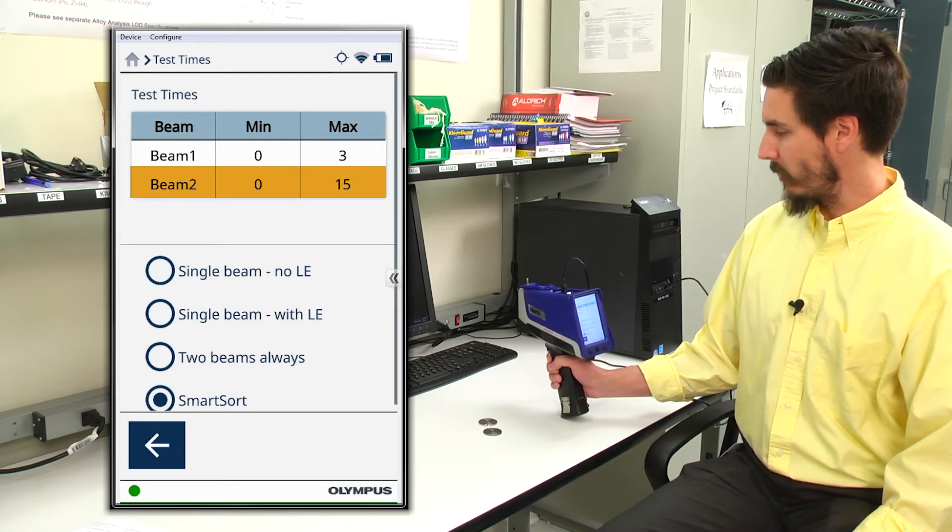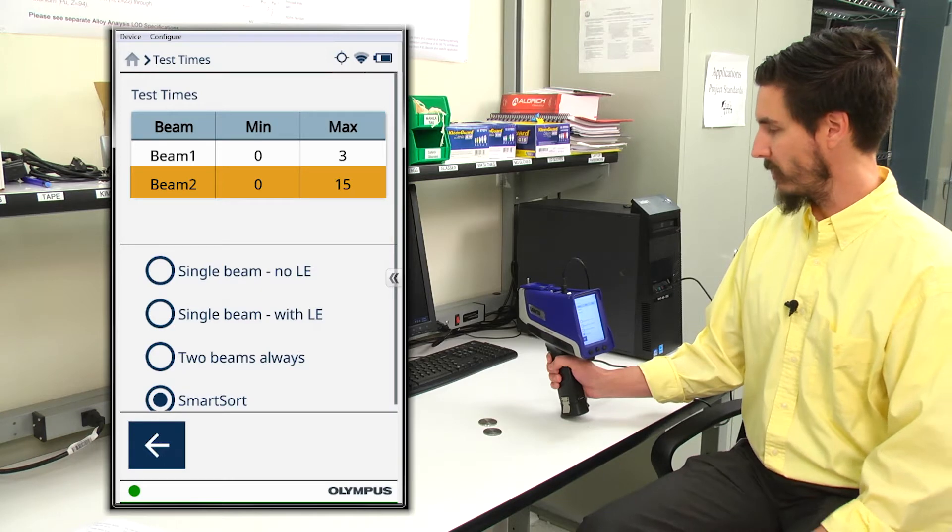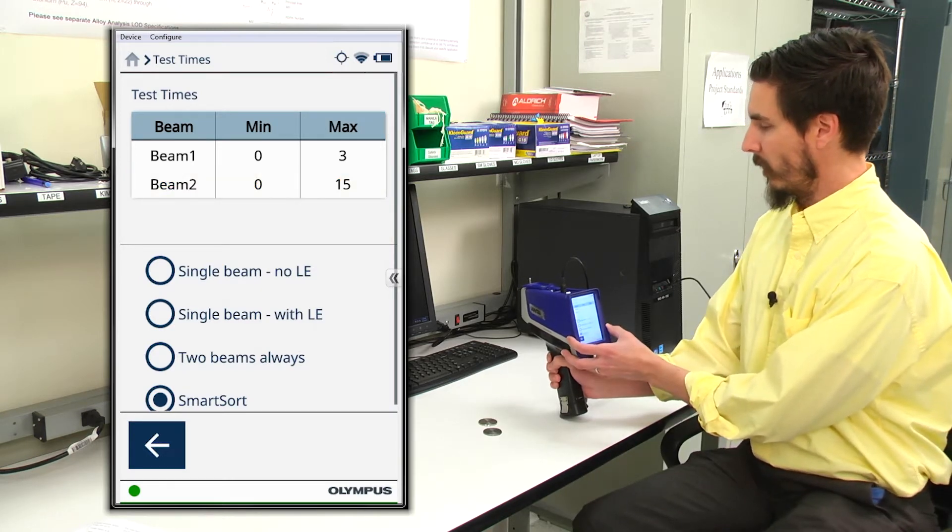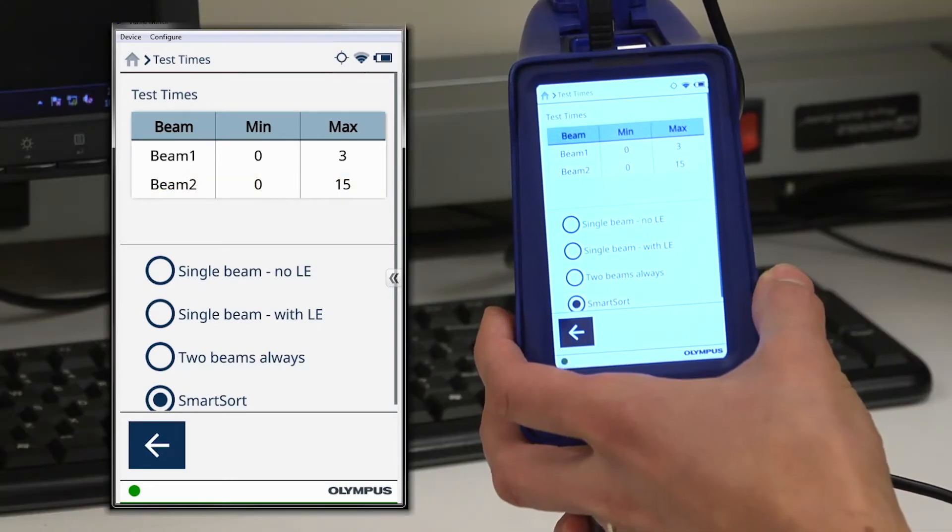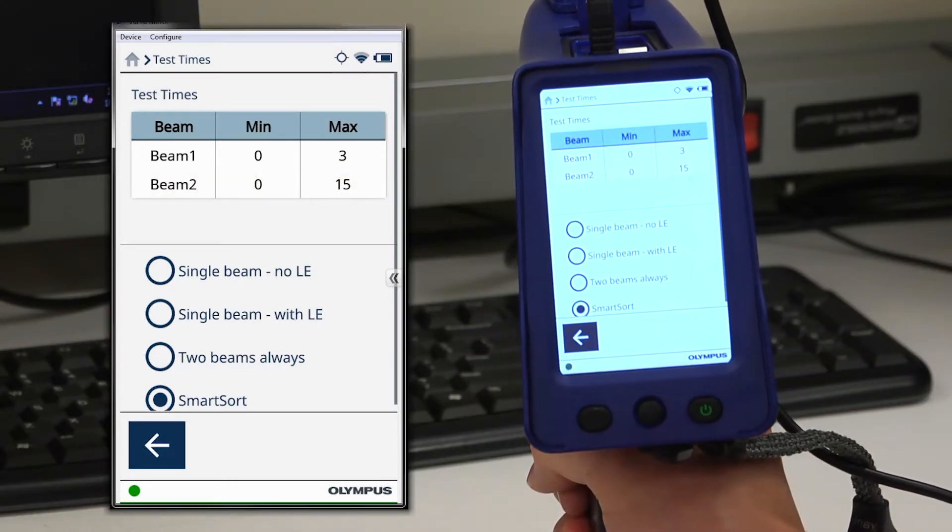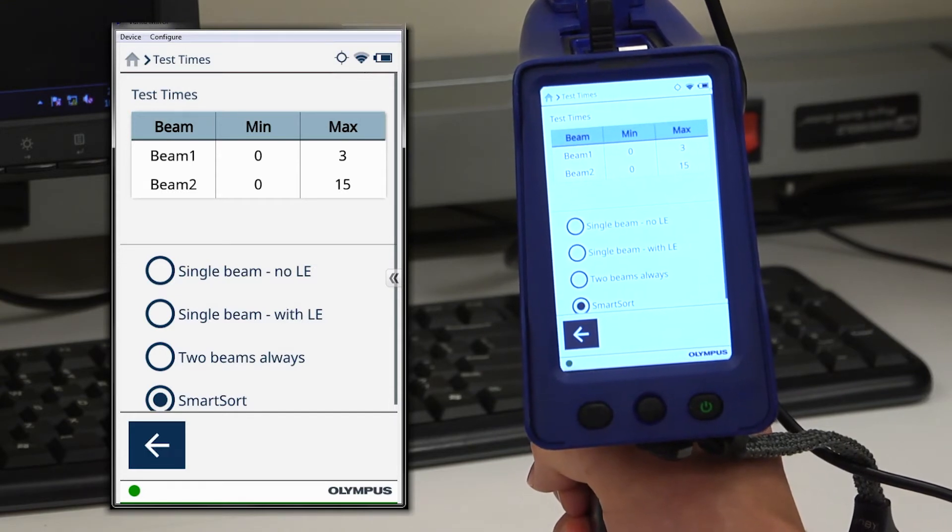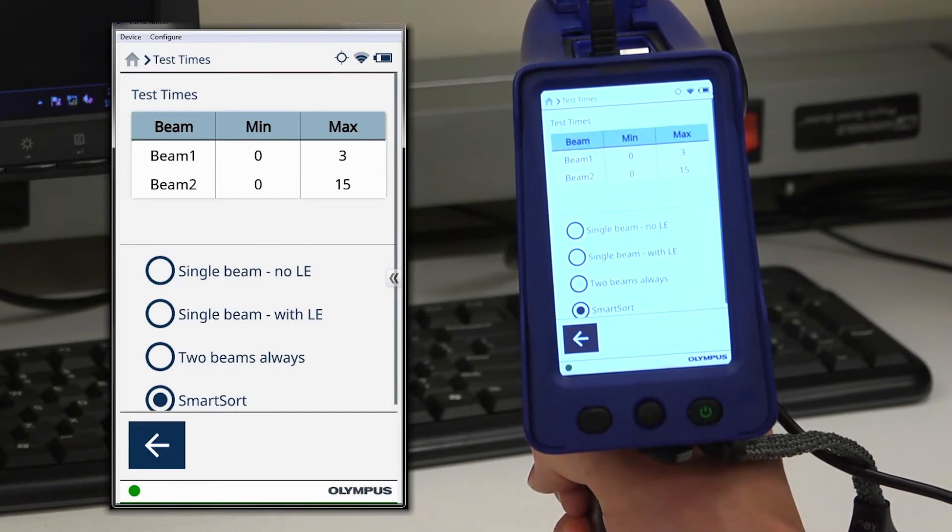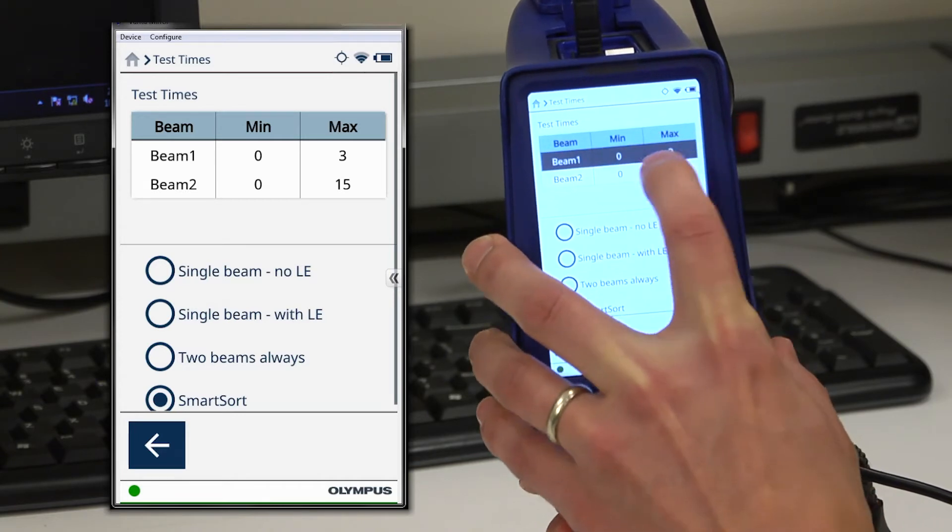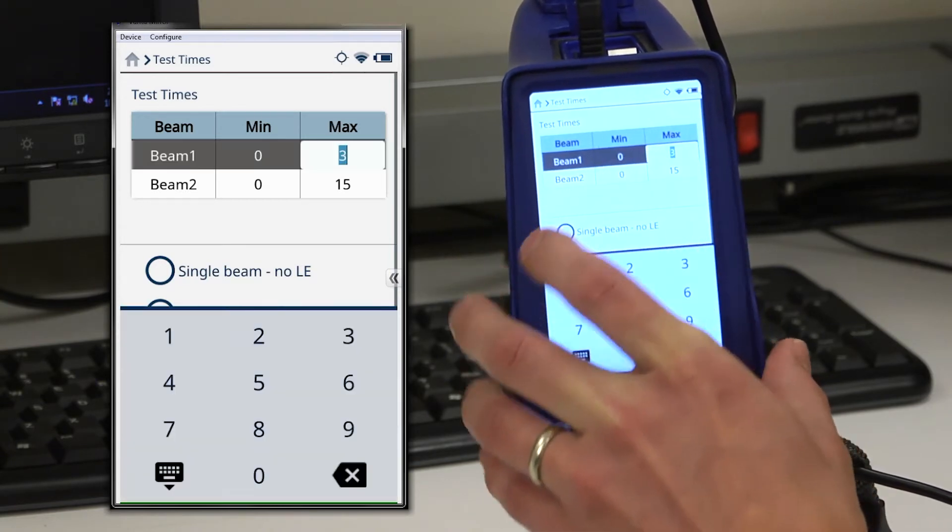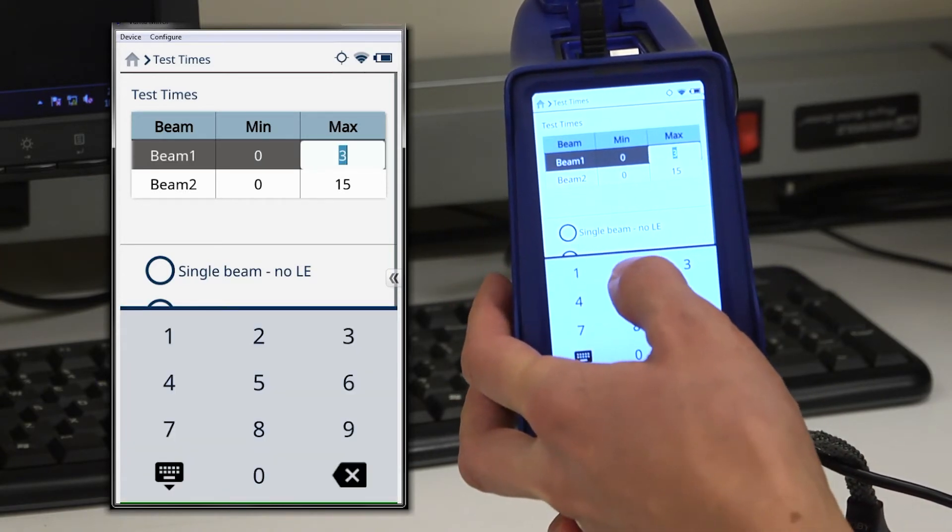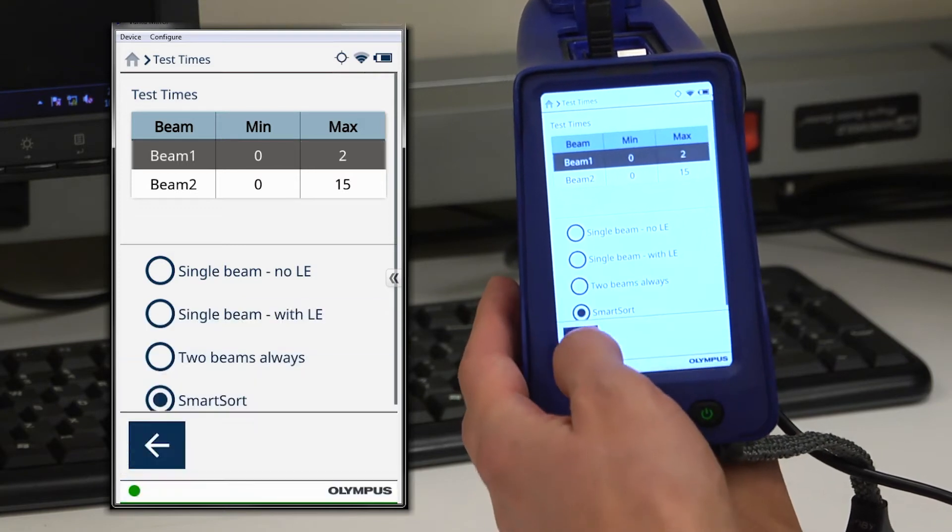So what I need to do now is select test times for each beam. For beam one, a maximum test time of only one to three seconds is plenty of time to allow the analyzer to make a grade match decision. For this application, I'm going to set a maximum test time in beam one of two seconds.